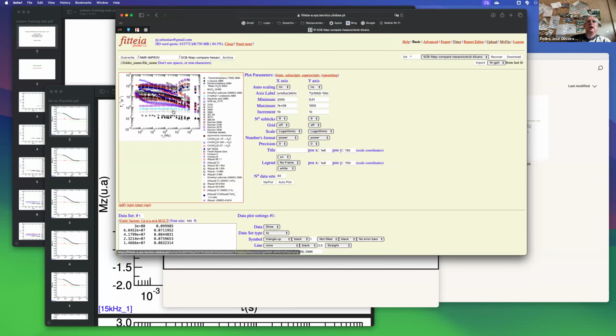Okay, you see lots of systems. The relaxation dispersions all fall within this range, the range accessible by both field cycling NMR and conventional NMR.